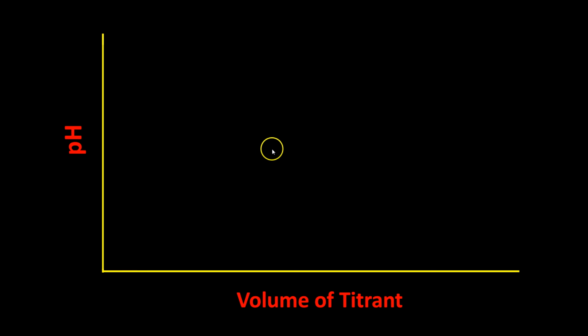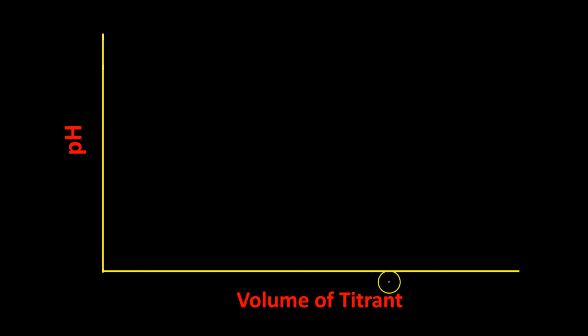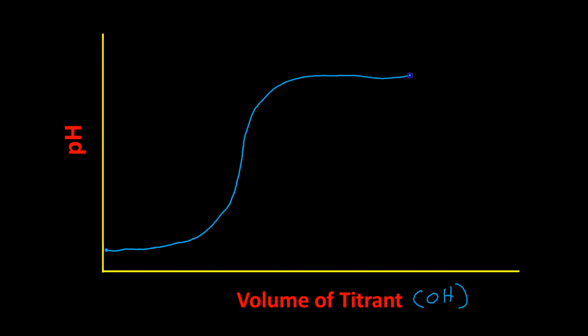And one thing I wanted to mention is that the example I showed you was titrating a weak base with a strong acid. But you can imagine that we could do the exact same thing if we started with an acid and titrated with a base. If we did a base, then we just do the exact opposite. If you started with a weak acid, you'd start with a low pH, you'd go through a buffer zone, you'd see a huge increase, and then tailing off.